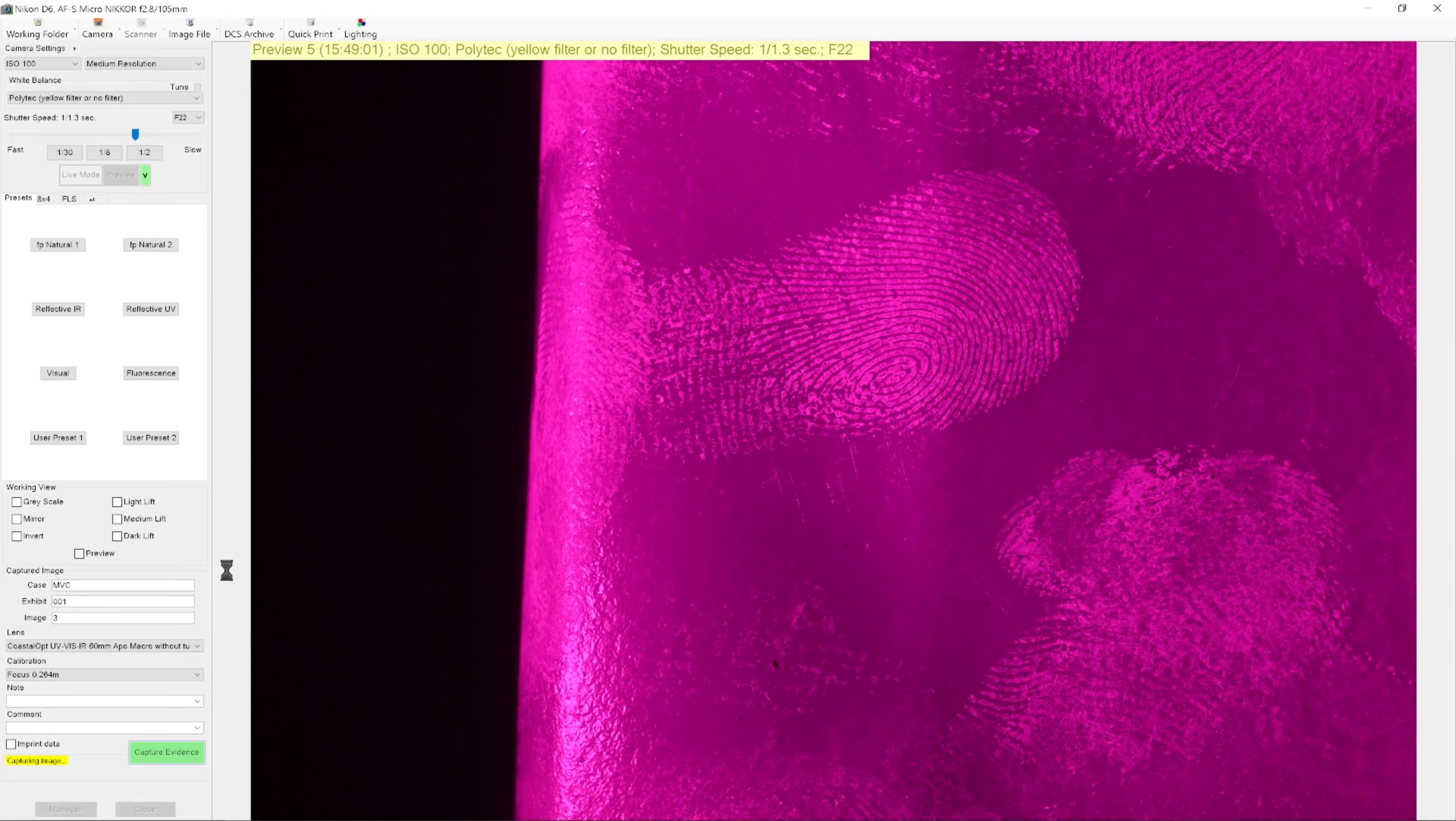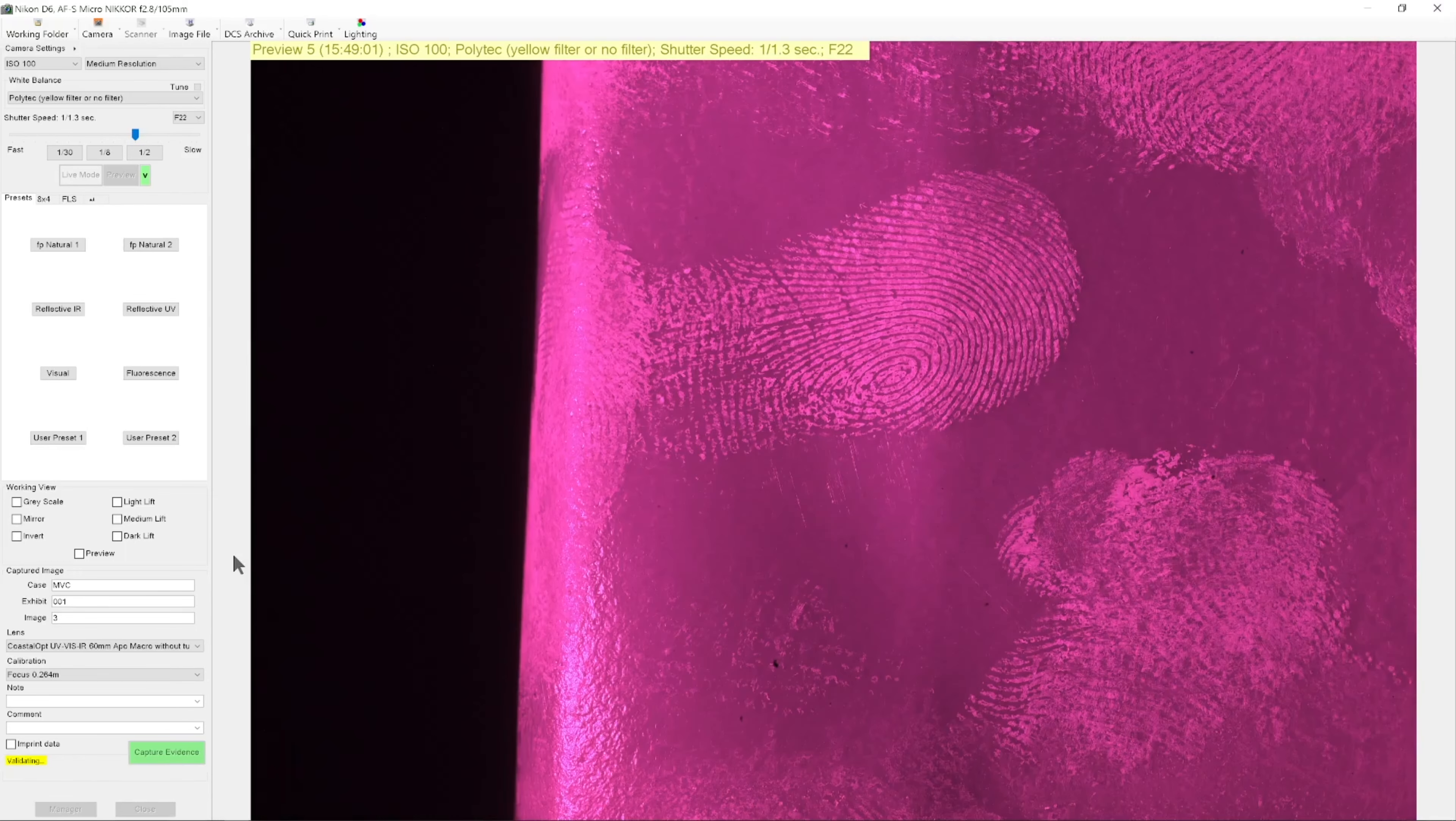In this case, it really is as simple as capturing and then performing some very simple enhancements.